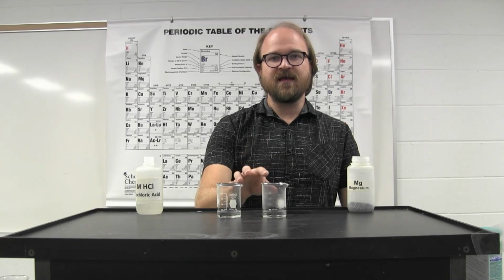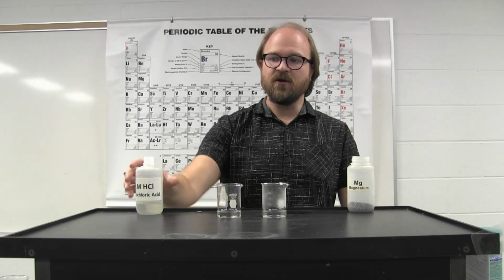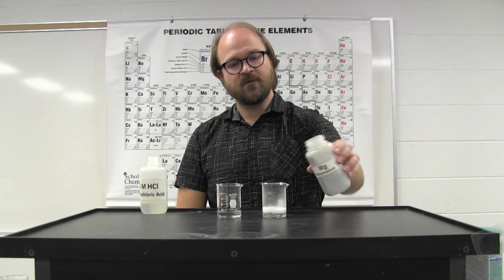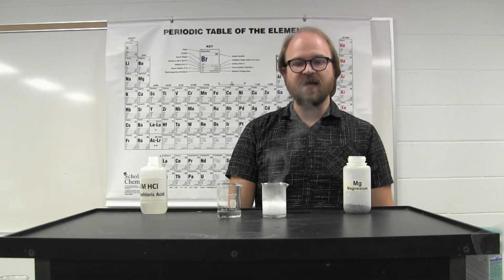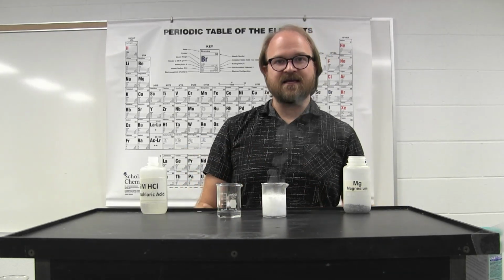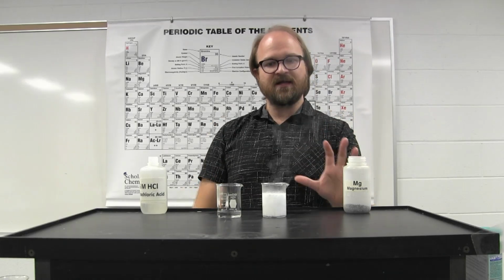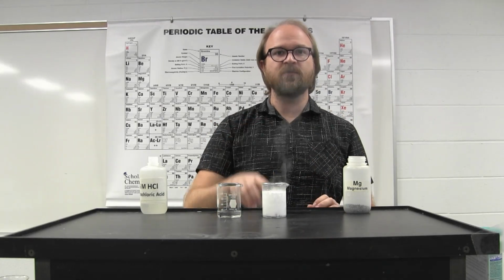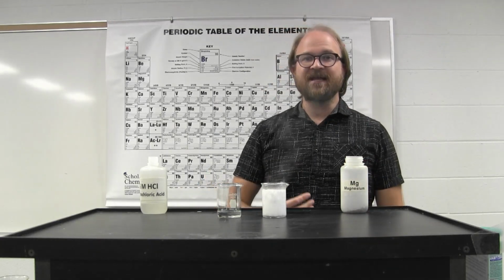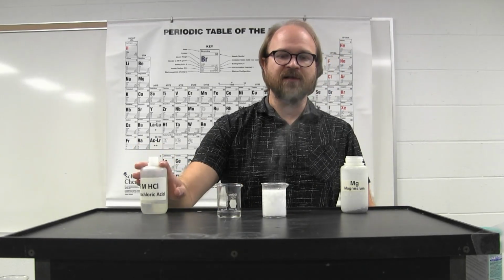So that means that there is no magnesium left in this reaction mixture for the hydrochloric acid to react with. However, if I add a little more magnesium, the reaction continues on. That means that there was still hydrochloric acid remaining. Hydrochloric acid was in excess. So the limiting reagent in that first reaction in the larger beaker was the magnesium. The reagent in excess was the hydrochloric acid.